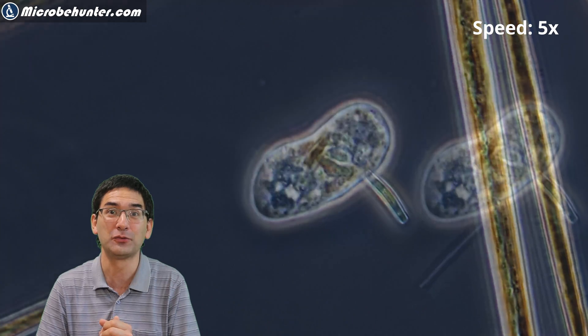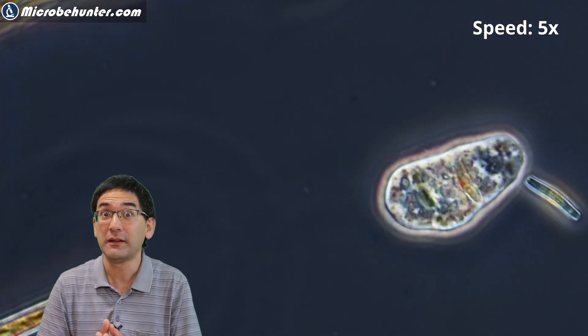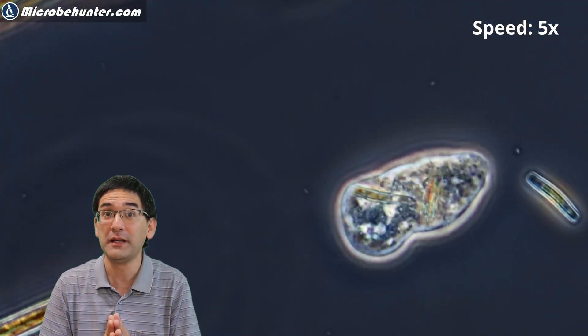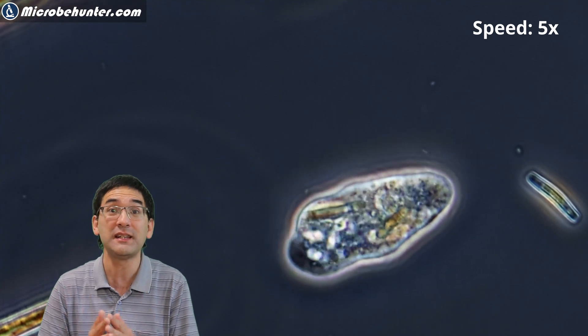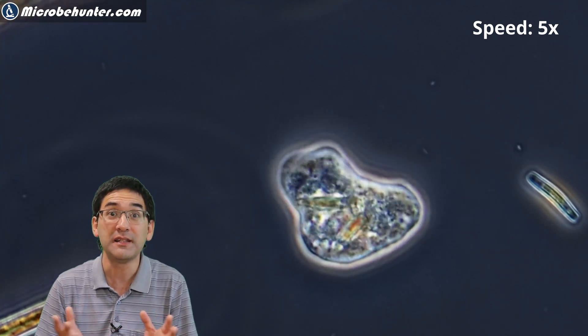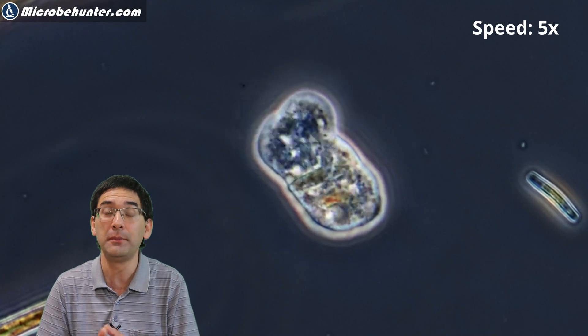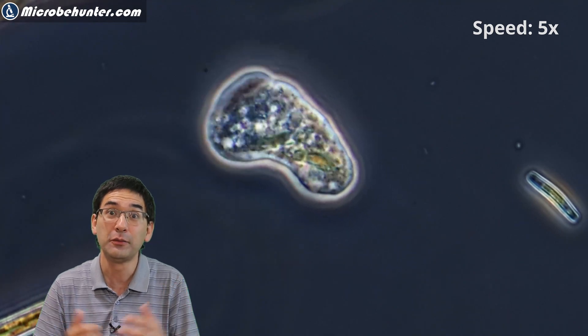I've seen this several times already. The bacteria were actually quite low in the sample, and the reason is that those amoeba essentially have also engulfed them and eaten them up. Apparently, maybe the bacterial count was so low that they now had to resort to other organisms like diatoms to feed on.